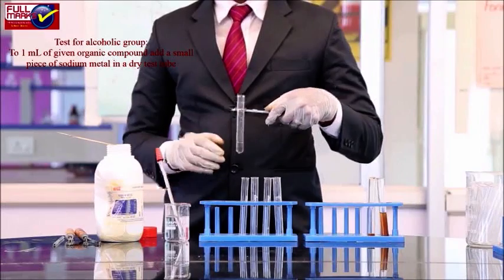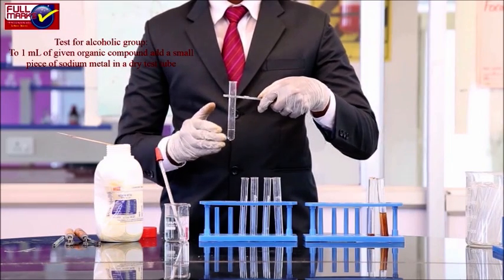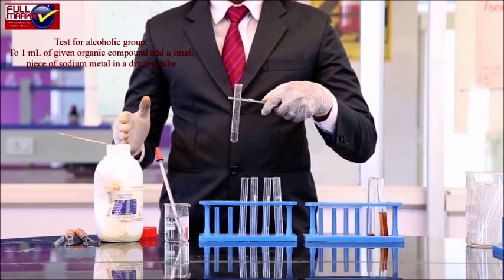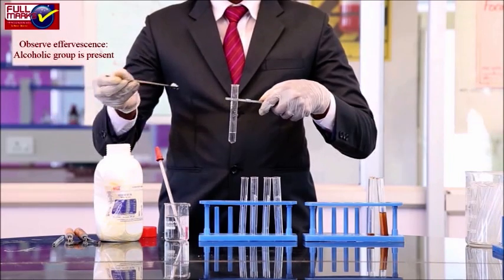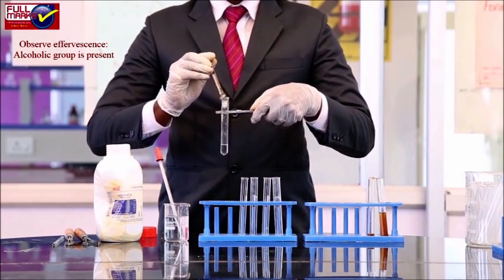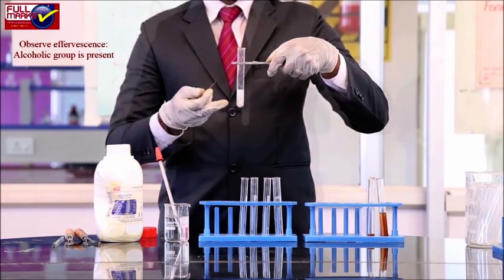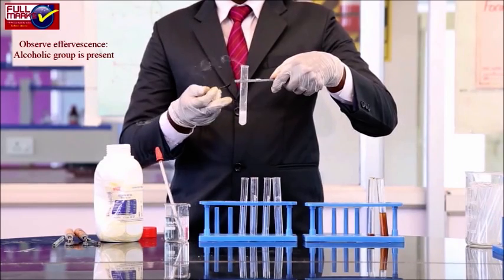Test for alcoholic group. To 1 ml of the given organic compound, add a small piece of sodium metal in a dry test tube. We observe effervescence. Alcoholic group is present.